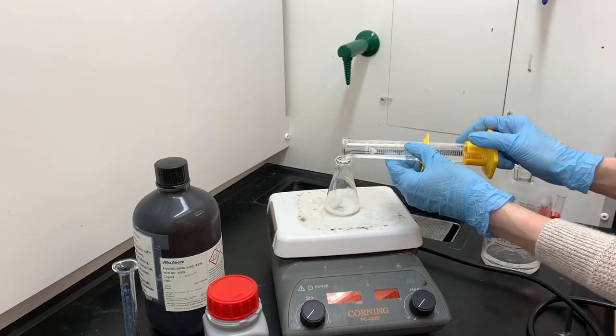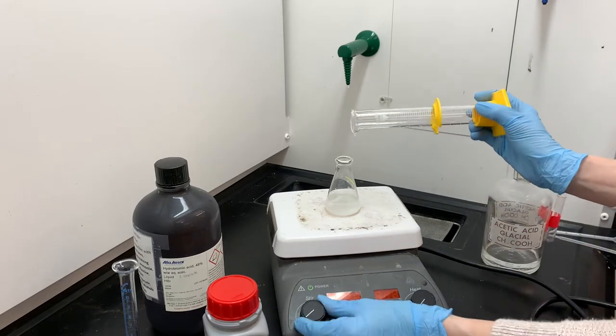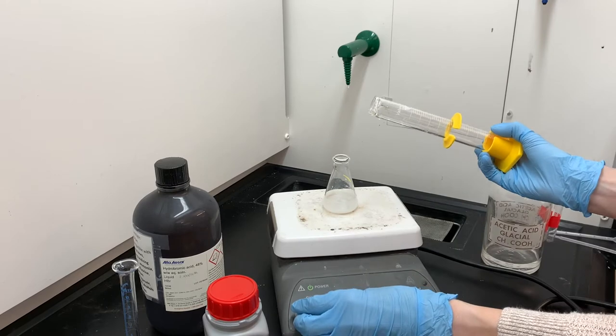If you notice, I've also added a little white magnetic stirrer. This reaction is going to stir for about 45 minutes at room temperature, so I'm not going to be using any heat on the hot plate, just stirring.